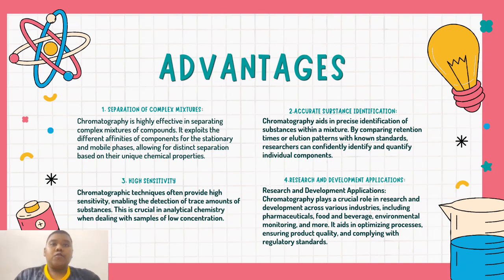Number four and the last one, research and development applications. Chromatography plays a crucial role in research and development across various industries, including pharmaceuticals, food and beverage, environmental monitoring, and more. It aids in optimizing processes, ensuring product quality, and complying with regulatory standards.